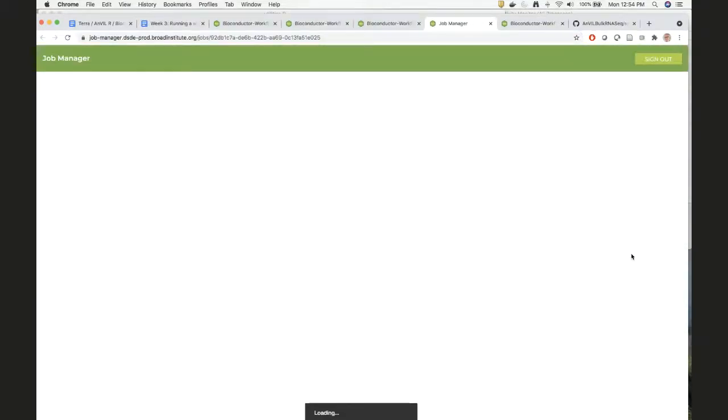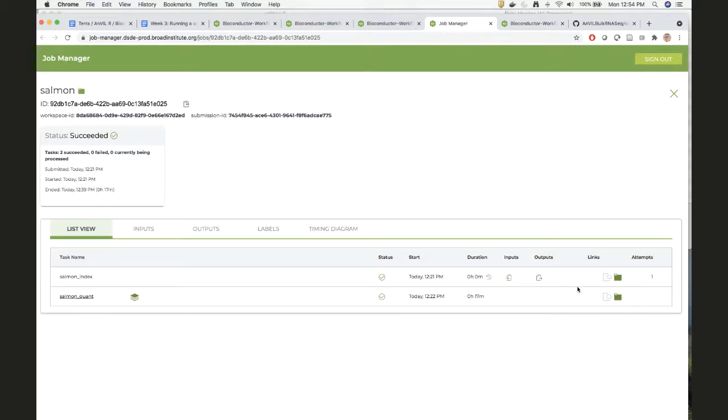Did you guys have success with your workflows? Are they completed as well? Yeah. Completed. Yes. Excellent. So I think that we've probably managed to spend a little bit of money on this workshop, so that's great.